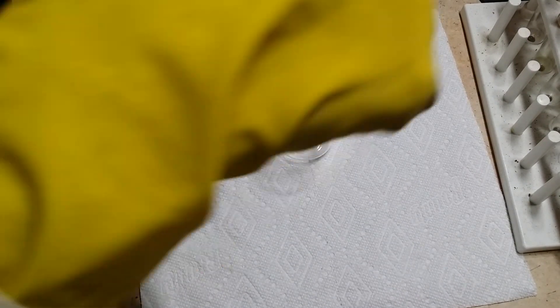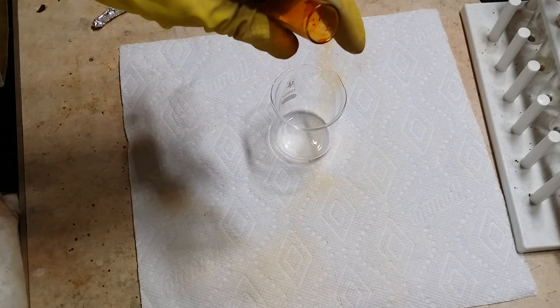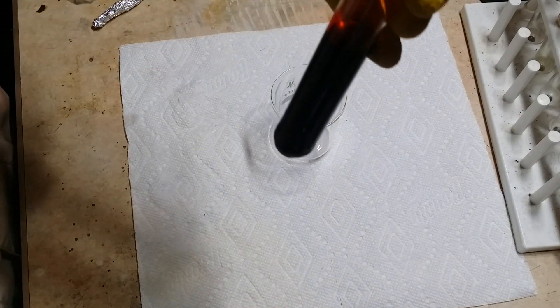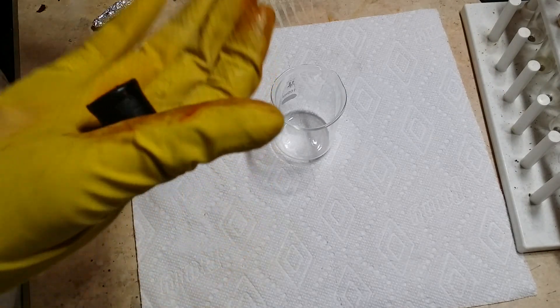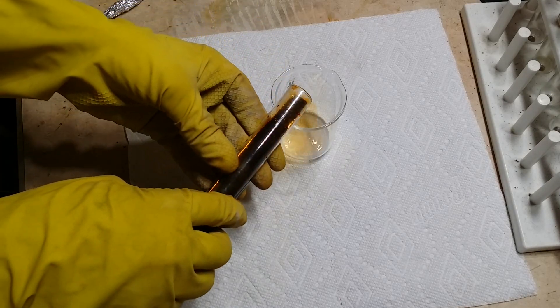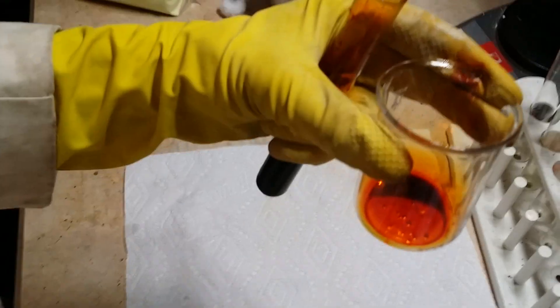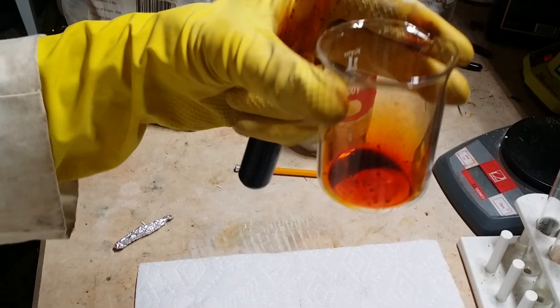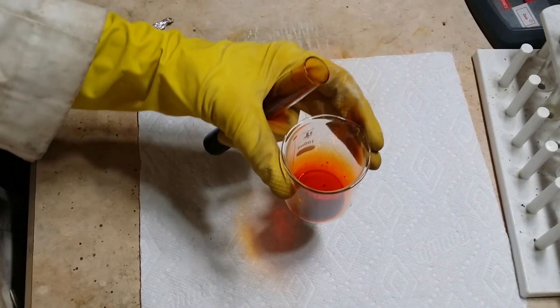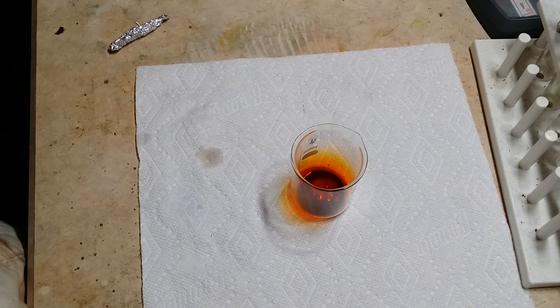Now that the respirator is on, I can open the test tube full of bromine. Already, you start to see the bromine vapors leak out. These vapors are heavier than air and thus they sink. Let's pour a little bit of it into the beaker. Bromine is extremely volatile and transfers to gas phase very, very fast. Let me grab a wet piece of litmus paper to show you just how acidic this stuff is when it comes in contact with water.